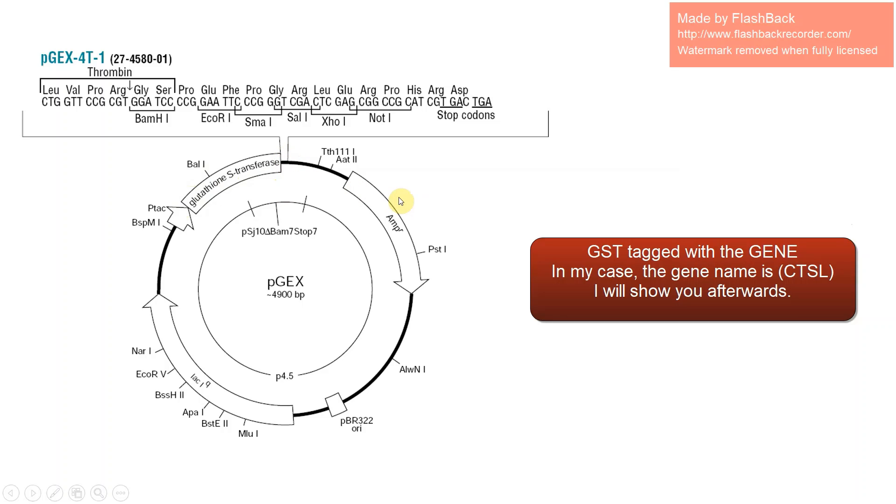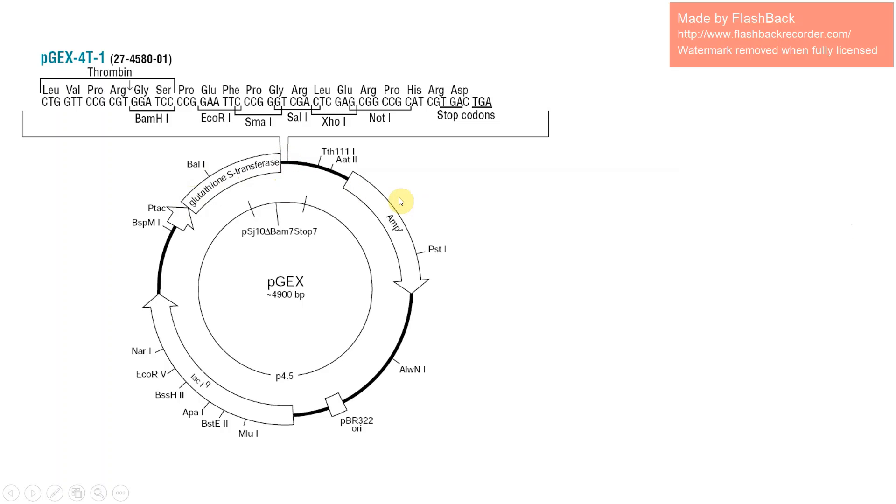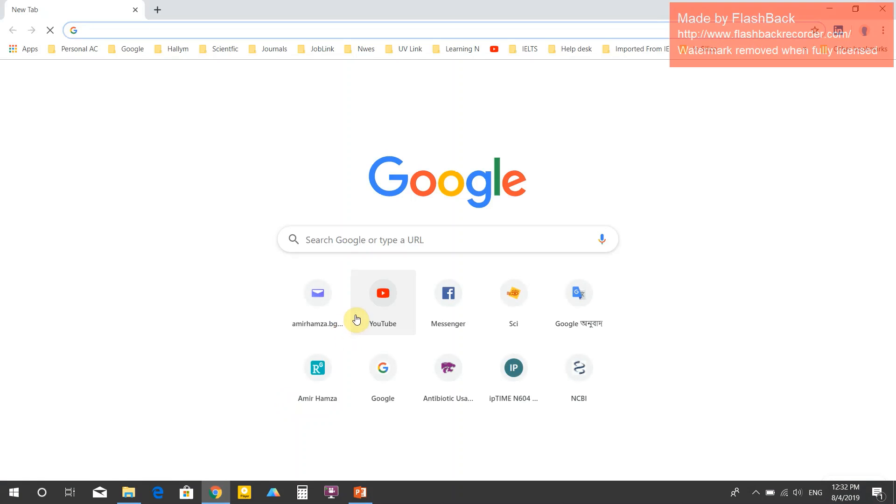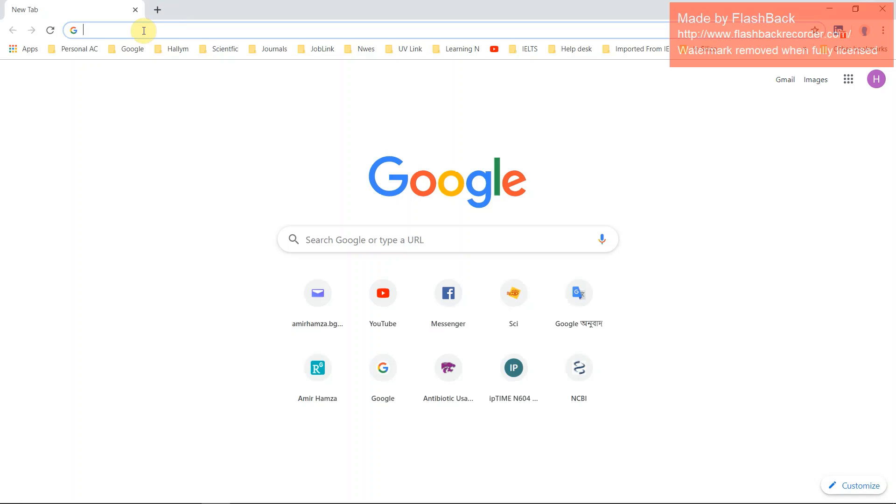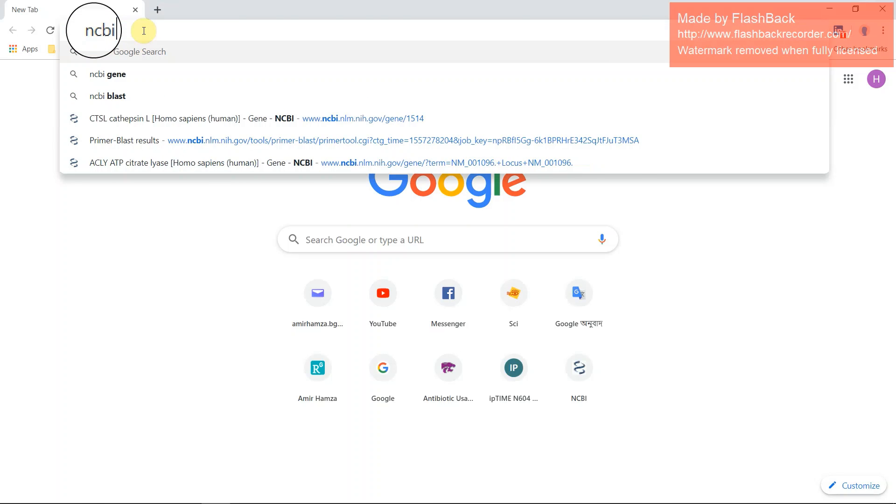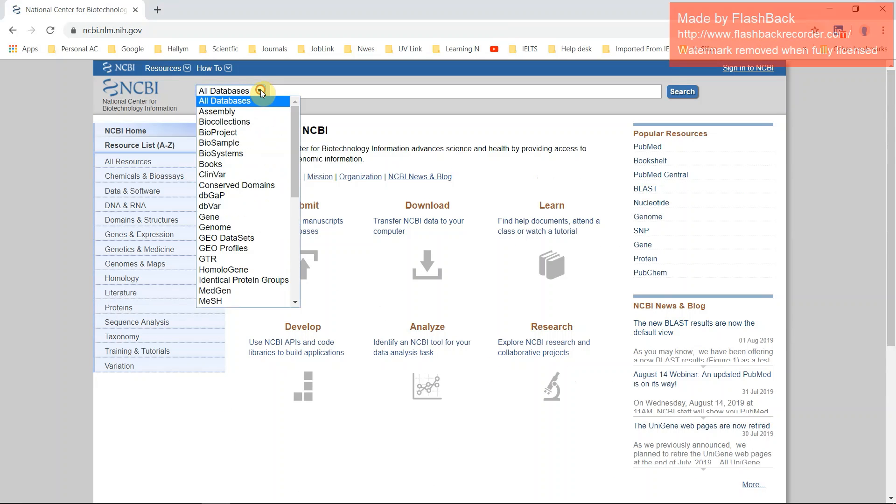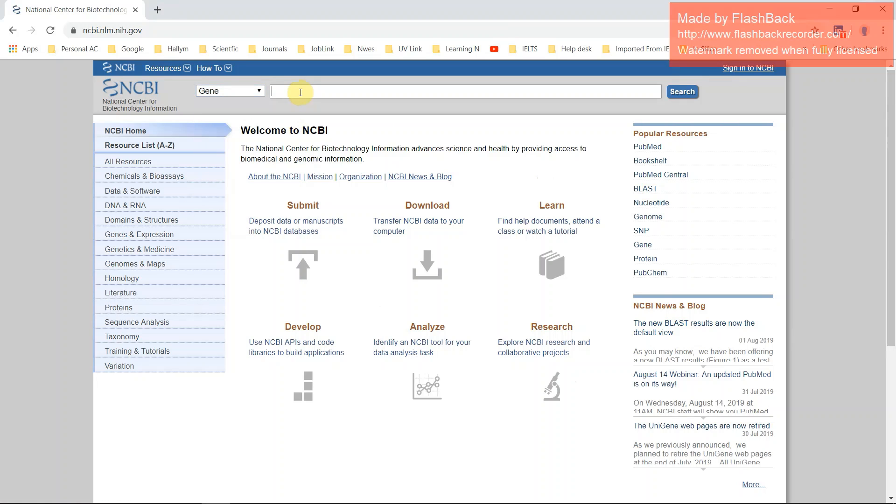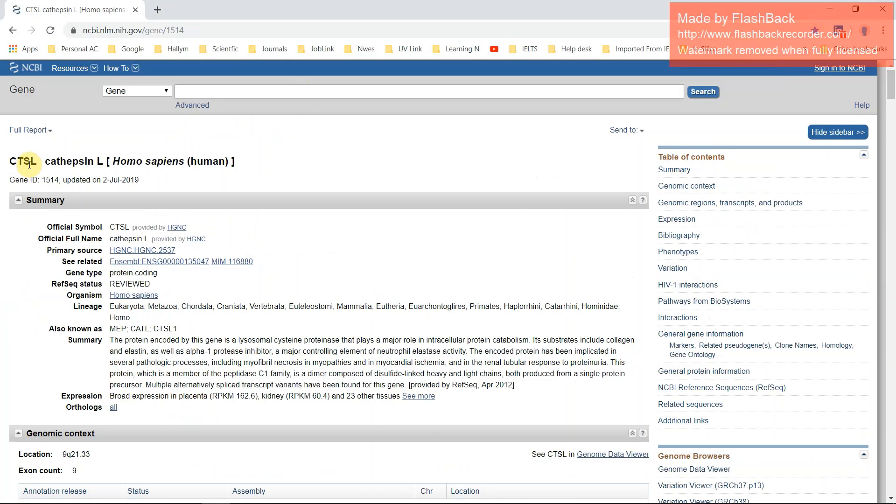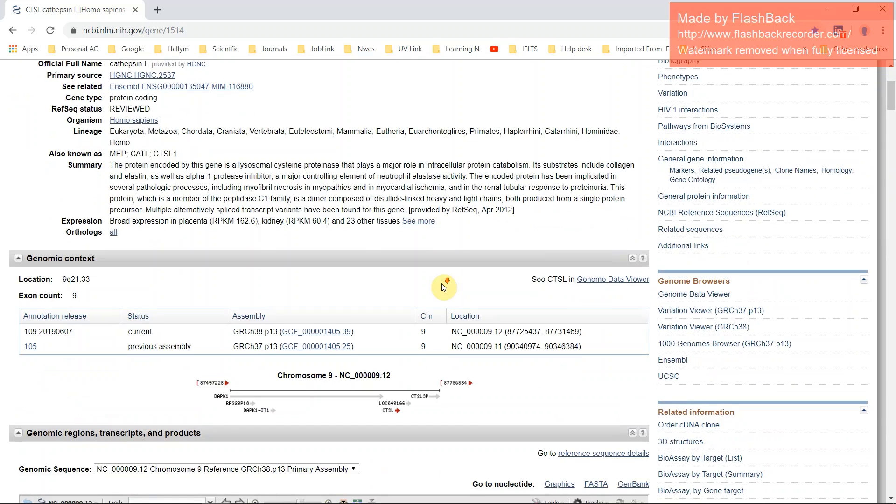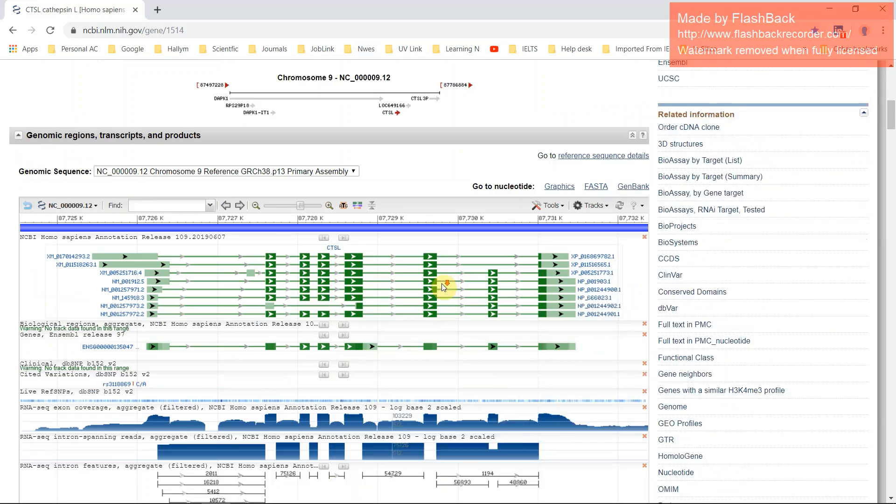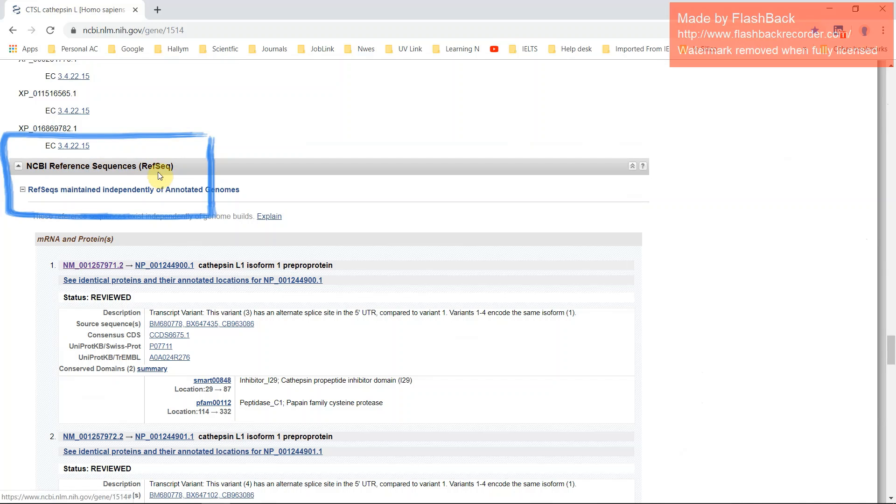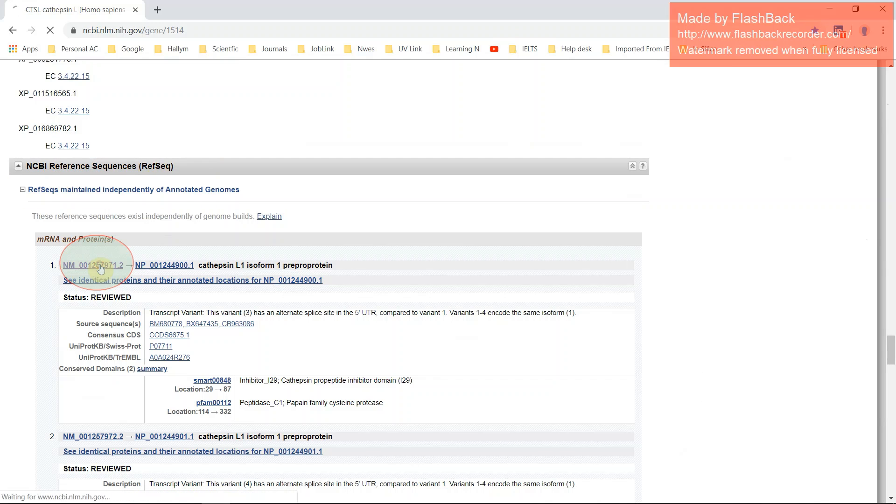Let's get started. How will you design your primer for your specific target gene? First of all, open your browser and search NCBI and select your gene. In my case, my gene name is CTSL. Here is the gene. Click here: cathepsin L homo sapiens. These are all the gene information. If you scroll and go down, this is the NCBI reference sequence, so click here.